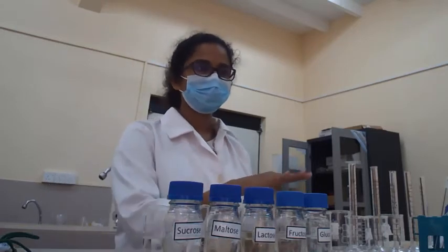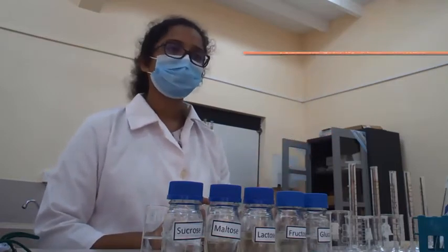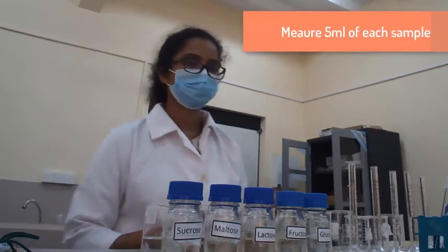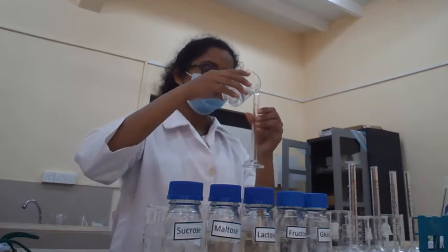Today we are going to practice the osazone test, which we use for identification of carbohydrates. For that we have 5 different types of sugar solution: glucose, fructose, lactose, maltose and sucrose. First we have to measure 5 milliliters from each. Before that we have taken the sample into this beaker, and we are going to measure 5 milliliters from each of these solutions. First we are going to measure 5 milliliters of glucose.